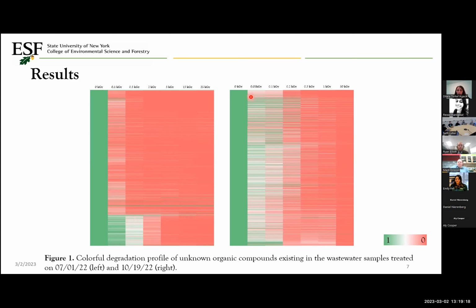So as I said, the first column of the tables represents the non-irradiated samples, and the rest of the results for the irradiated doses have been normalized by the non-irradiated results. I mean, we normalized these results with the non-irradiated one to see the comparison between non-irradiated and irradiated ones. Okay, so this bar shows a transition from green to red color. The green color shows that the pollutant exists in the sample, as you can see in the first columns. And then the red color shows that the amount of pollutant has decreased or it does not exist anymore in the wastewater.